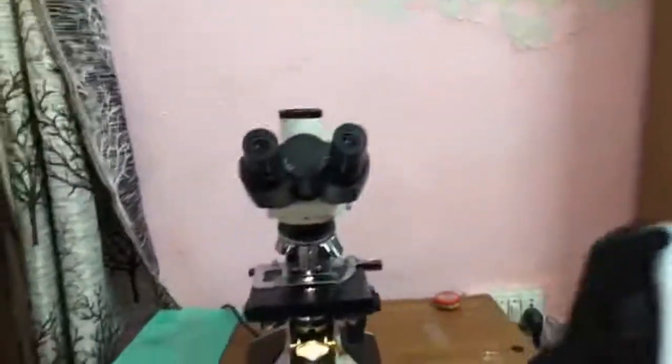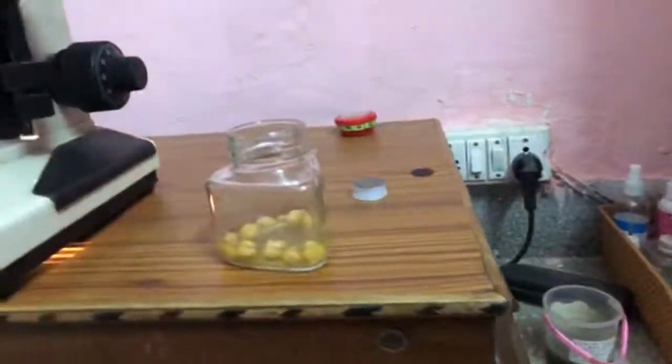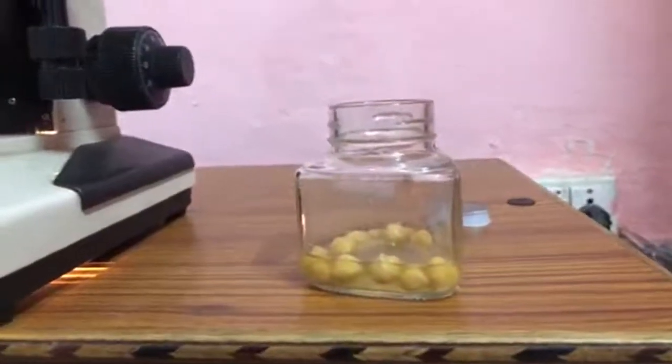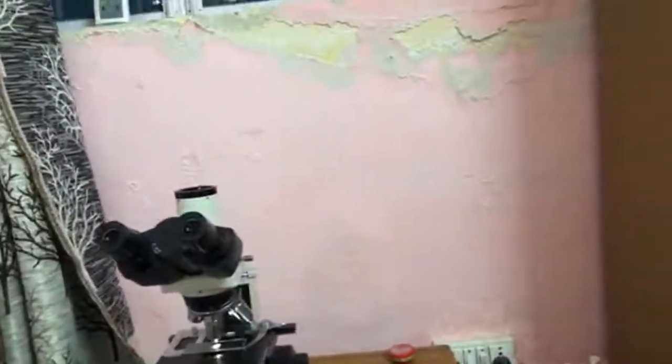What I plan today is that I have a little bit of water sample, some of a pond, which is the bottom layer water, and you can see there's a lot of mud. I've been keeping it here for some days now, and you see a kind of a biofilm has been formed on the side walls, and a lot of debris has precipitated. Further, I'm also preparing another culture of amoeba here in this glass jar. Today, I'll be just taking a drop of water and see through it and see what we can find.